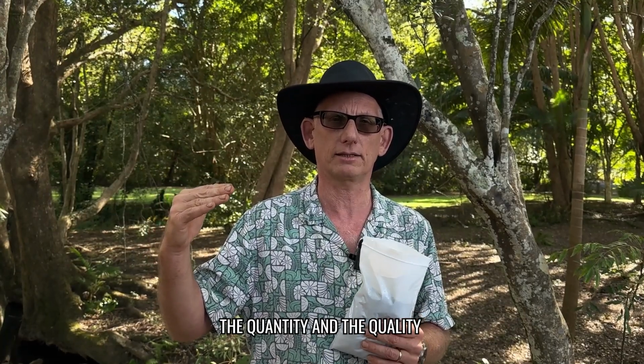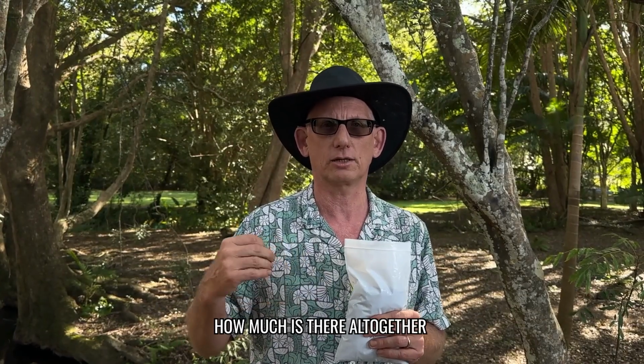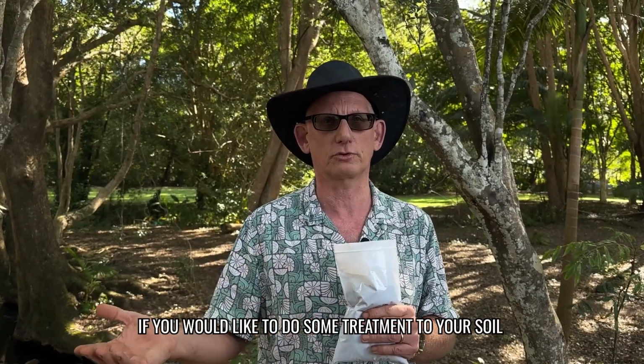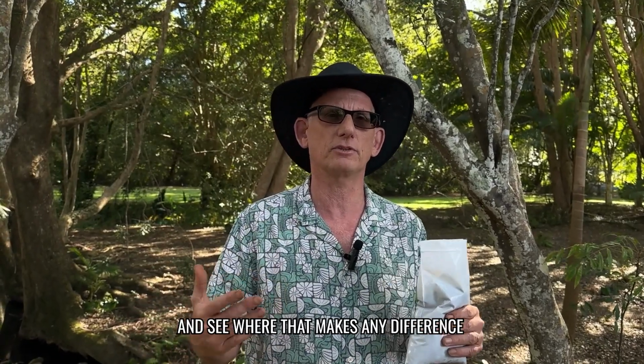The quantity and the quality, which means we find out about the diversity of the microbes and also how much is there altogether and whether any pathogens may be there. This is very good to compare if you would like to do some treatment to your soil. You can look at the soil DNA before and after your treatment and see whether it makes any difference for your soil health.